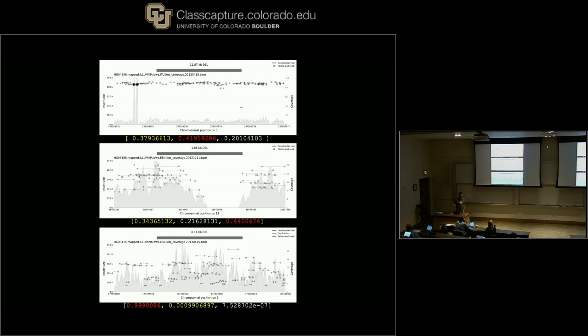Feel free to answer. Yeah, the blank space. There's this big drop in coverage here, right? So maybe there could be a gap. Maybe there is definitely an event going on. So we need to make things a little bit better and have the query variant correspond to the event. We're still working on that. When we trained, we cropped out everything, all these words, all the axes, the bar up here, to hopefully make the training a bit better. It's quite good, but maybe we can do something to make sure that the event matches the query.